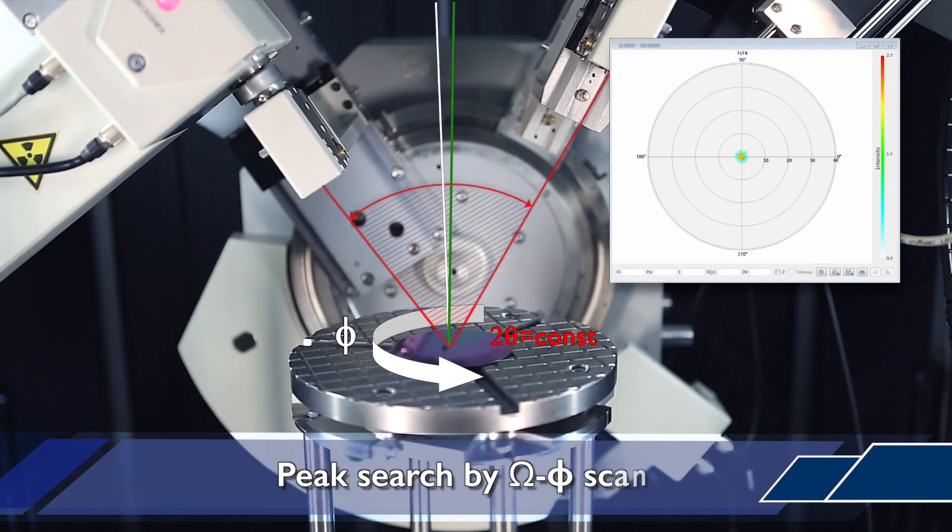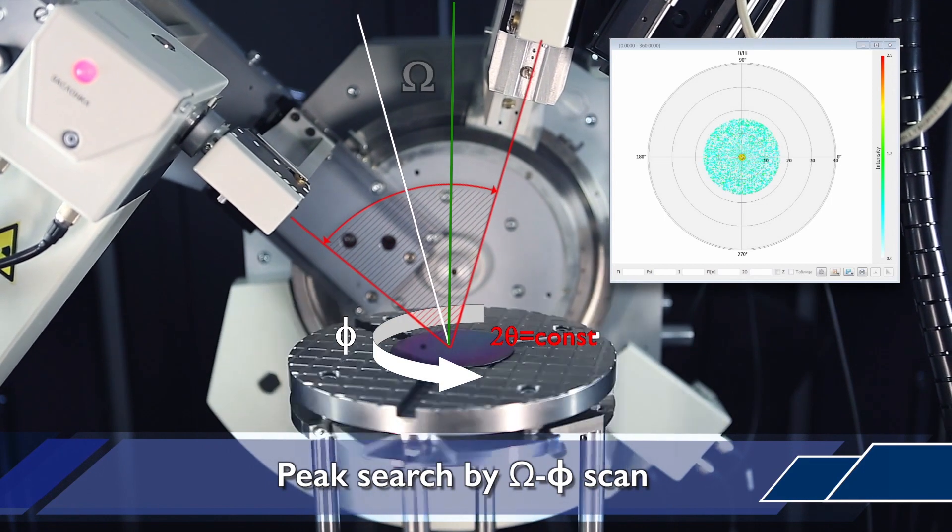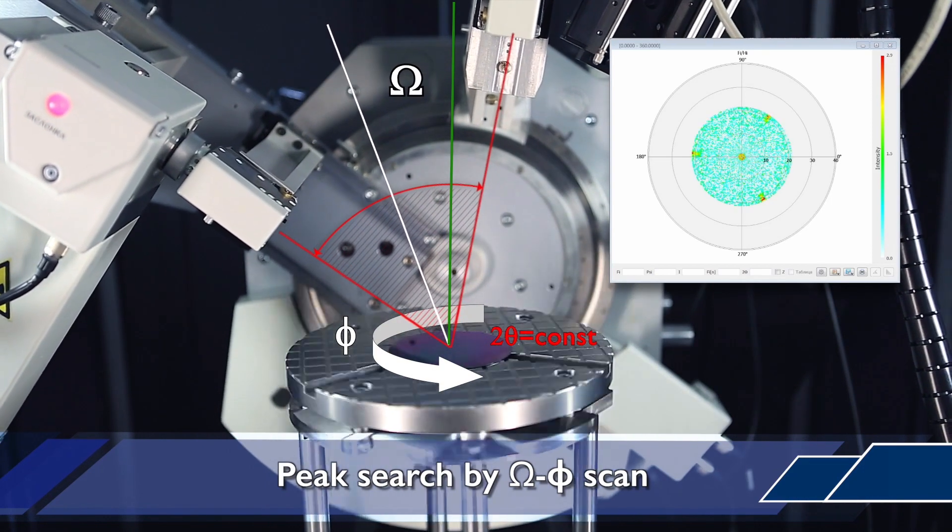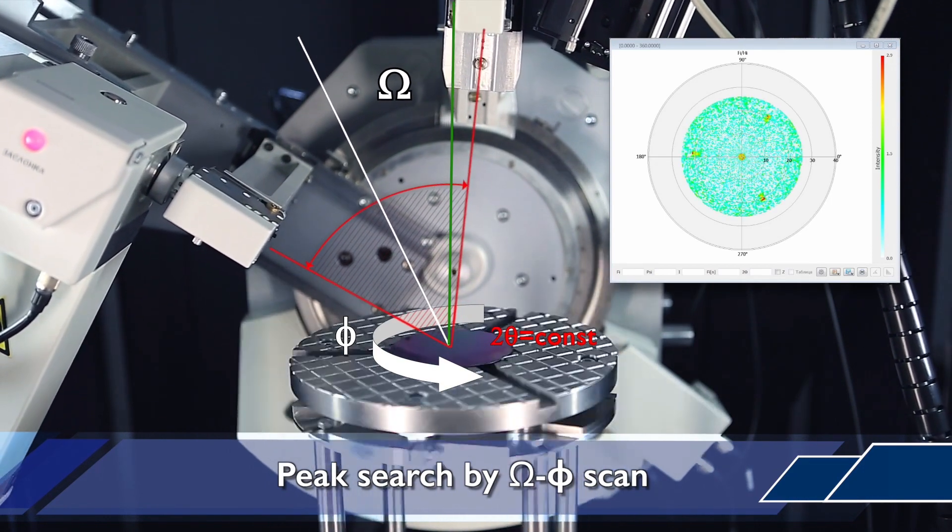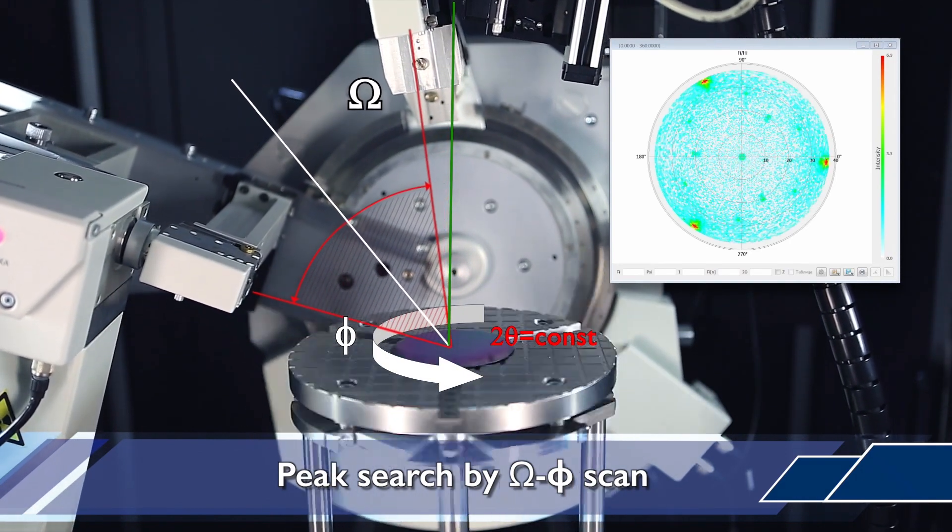One more important task which can be easily solved with the Drone 8 diffractometer, equipped with the holder for large samples, is the determination of single crystal orientation. Peak search by omega-phi scanning usually takes a minute.